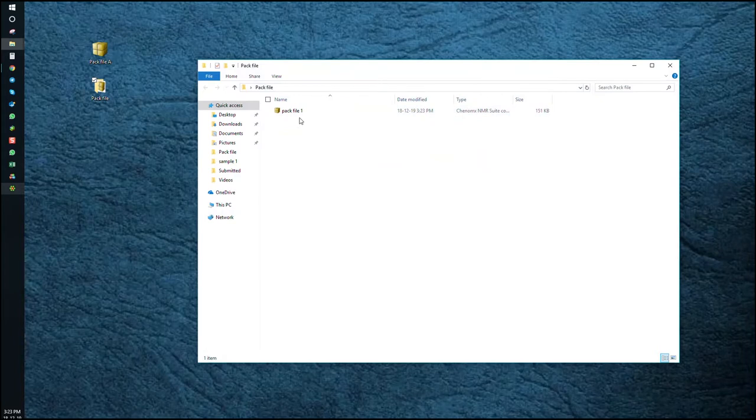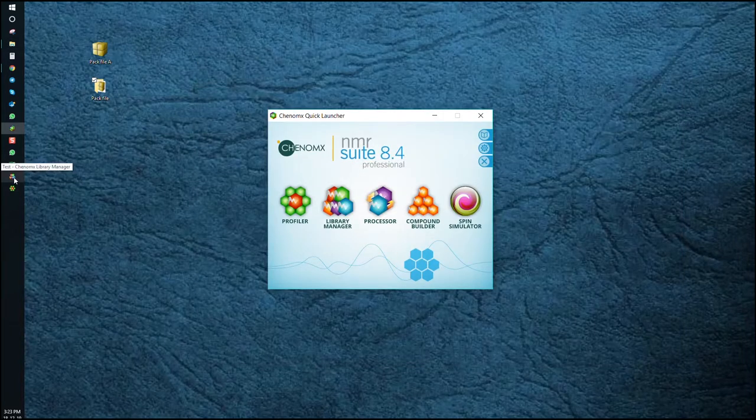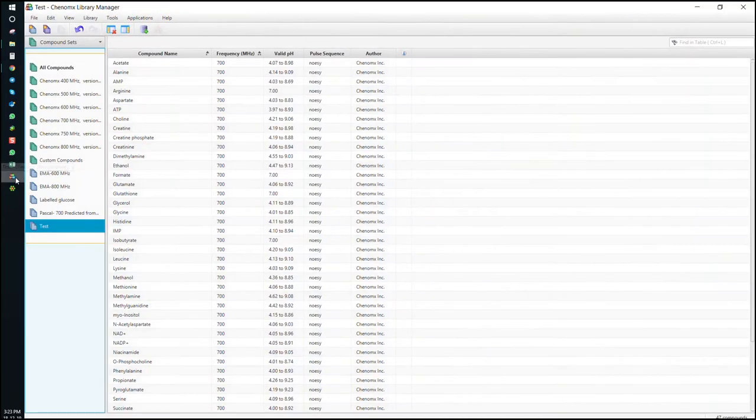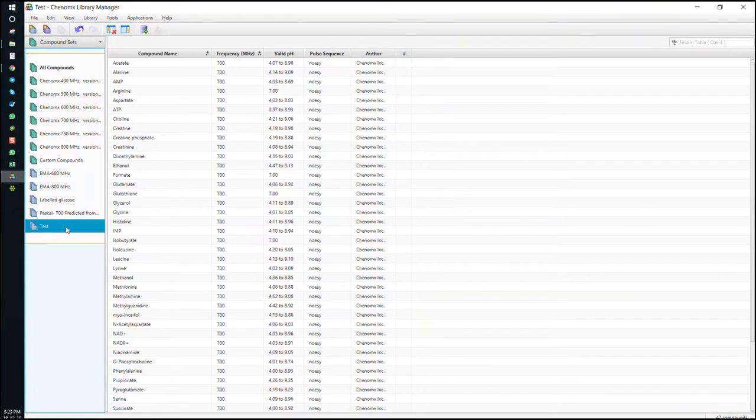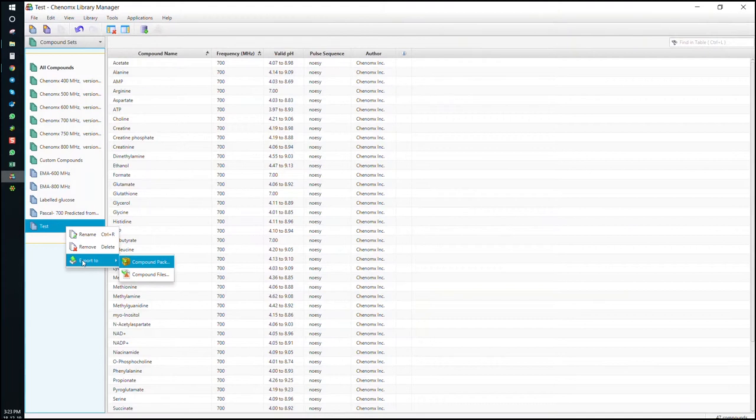We can also make a PAC file from the library manager. Open the library manager module. Choose your library containing the relevant signatures and right-click. Export to compound PAC.